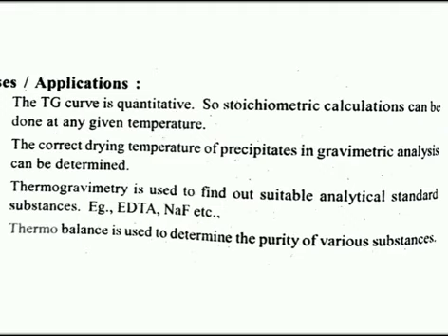Thermogravimetry is also used to find suitable analytical standard substances, for example, ethylene diamine tetraacetic acid and sodium fluoride.